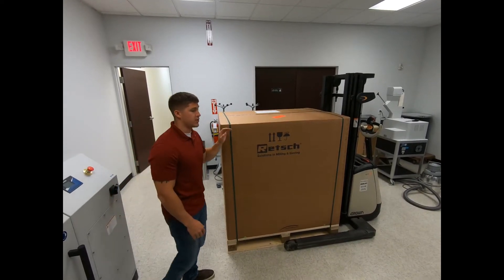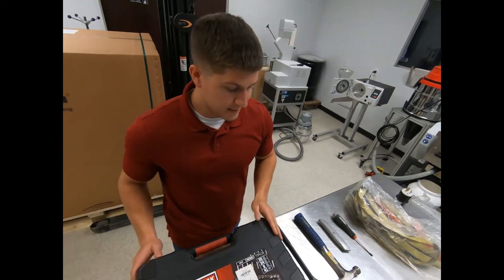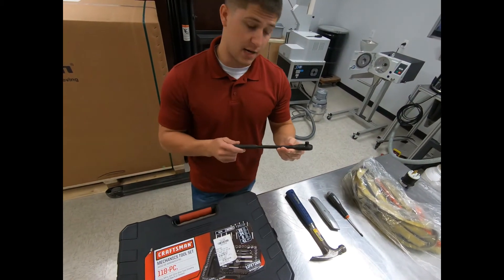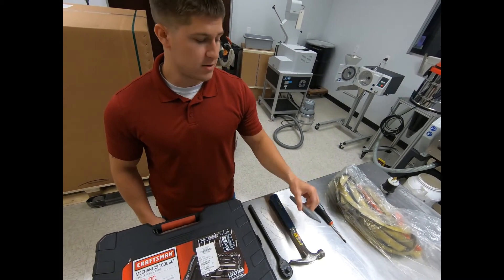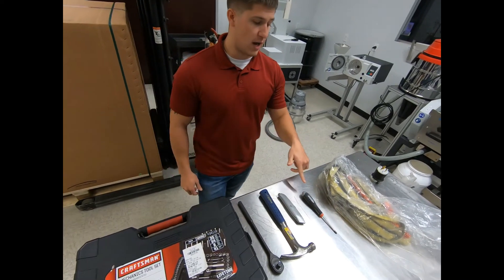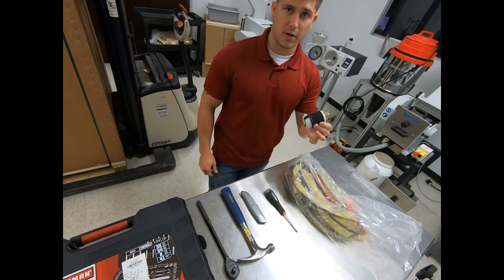Some of the tools you're going to need to unbox this: a basic mechanics tool set which may include a socket wrench, a basic hammer, a box cutter, a Phillips head screwdriver, lifting straps, and of course your power plug.